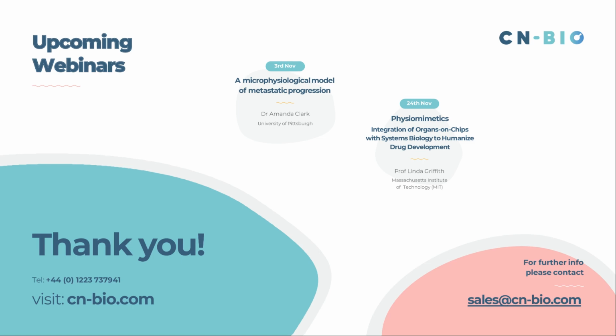We actually, as I showed you again, one of those latter slides, have multi-organ setups where we could link something like a skin culture to a liver culture, and you could imagine how the local effects on the skin could then go on and affect other organs in the body. So we can set things up actually quite flexibly on the platform. But as I said at the beginning, looking at skin toxicity is not a particular area of focus that we've looked at to date, and there are a number of other models out there that could do that.